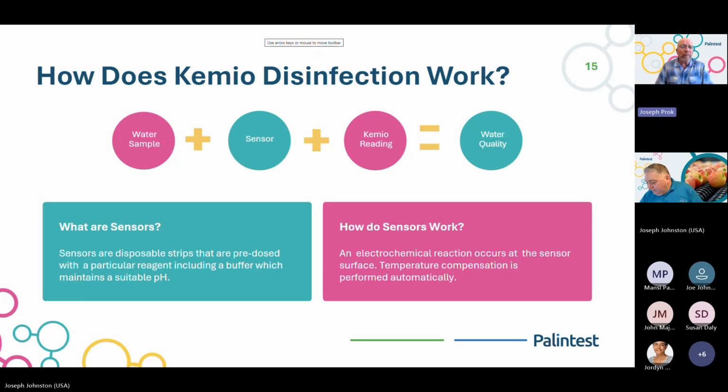Now, what we'll cover right now is how in the world they're measuring amperometric or electrochemical. And what this is, the sensors are comprised of basically 3 subcomponents, one of which is the substrate on which the electrodes or these conductive strips are actually laid.